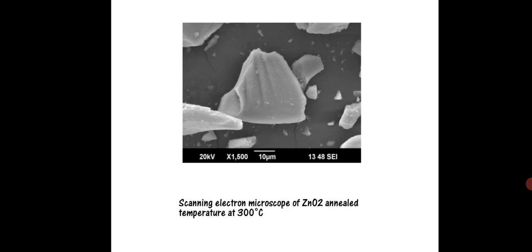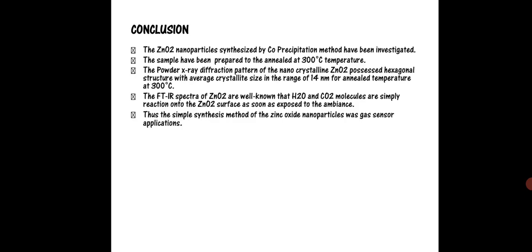The conclusions of zinc oxide nanoparticles by the co-precipitation method.